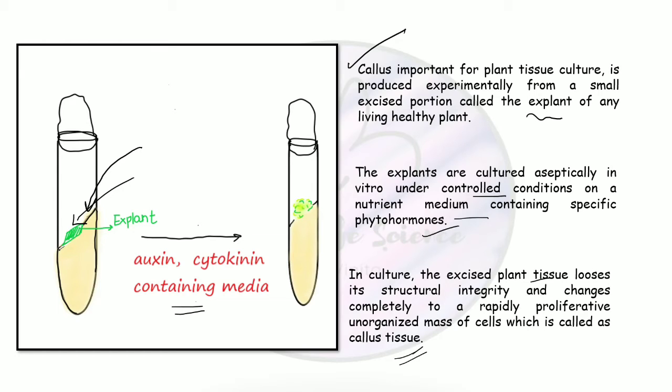So this is what happens in the laboratory. After inoculation of the explant and after a particular time of incubation, you will see a mass of cells which you name callus. This is what a successful callus induction means.